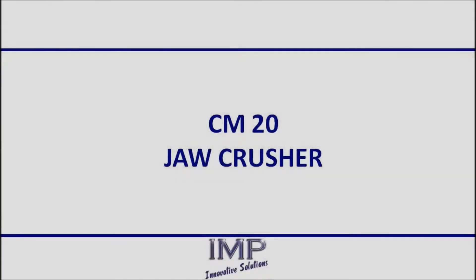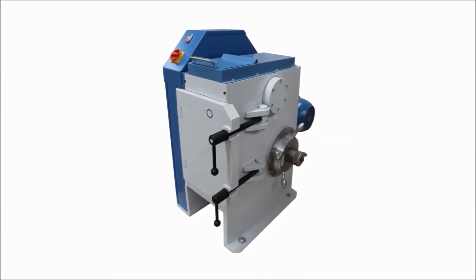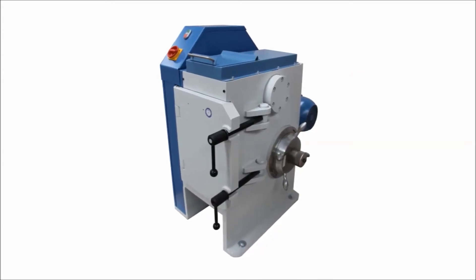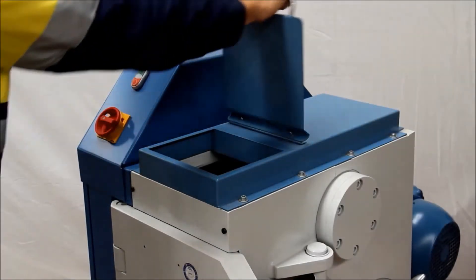IMP presents the new benchmark for mineral laboratories, the Crushmaster CM20 jaw crusher. This super fast and efficient crusher is suitable for crushing particles up to 110 mm in size, reducing them to less than 2 mm in a single pass.